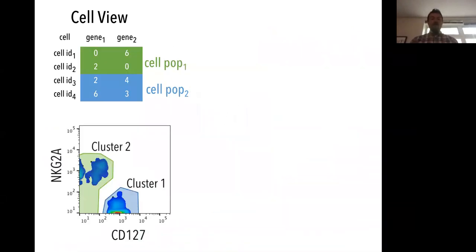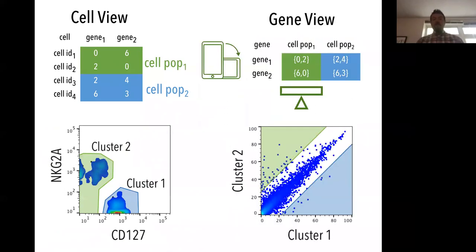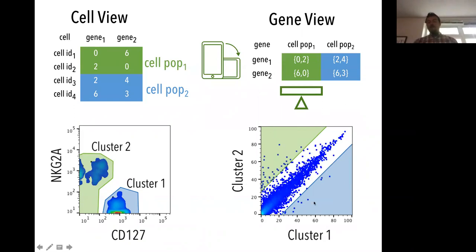Here's an illustration of how gene view works. We have a data matrix with different populations defined by geometric gates for two different parameters. If we transpose that data matrix, different genes essentially behave as the cells from the previous matrix, and populations behave as the parameters. Genes overexpressed in cluster two will be found in one region, and genes overexpressed in cluster one will be found in another region of the gene view graph window.